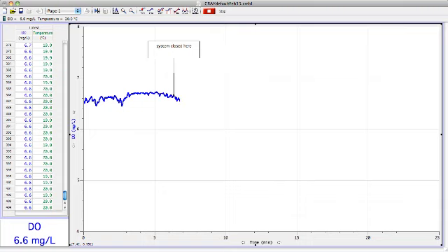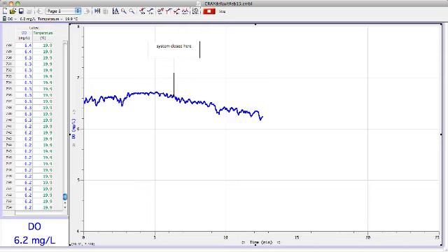We're trying this with a single crayfish. Of course, we would get a much more rapid rate if we had two, but we're going to try one today. Okay, as you can see on the graph, we've gone from about 6 minutes to about 13 minutes, and there's a nice downhill slope there, just using one crayfish.